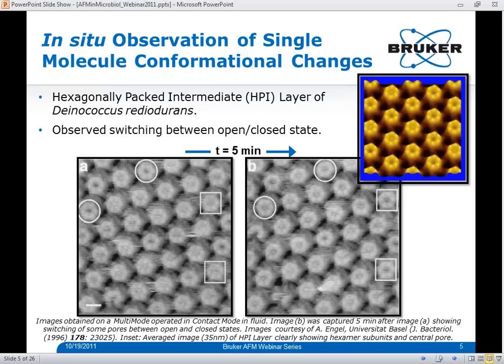In addition to static imaging, AFM has also been able to detect single-molecule conformational changes within cell surface structures. Researchers used AFM to obtain high-resolution images of the hexagonally-packed intermediate, or HPI layer, of Deinococcus radiodurans — a type of bacterial S layer. Averaged images clearly show the six individual subunits of the hexagonally-packed protein molecules, with the central pore exhibiting two conformational states: closed, where a central plug is present, or open, where this plug is absent. Continuous imaging showed that pores actually switched between open and closed states, as indicated in two consecutive images captured five minutes apart.